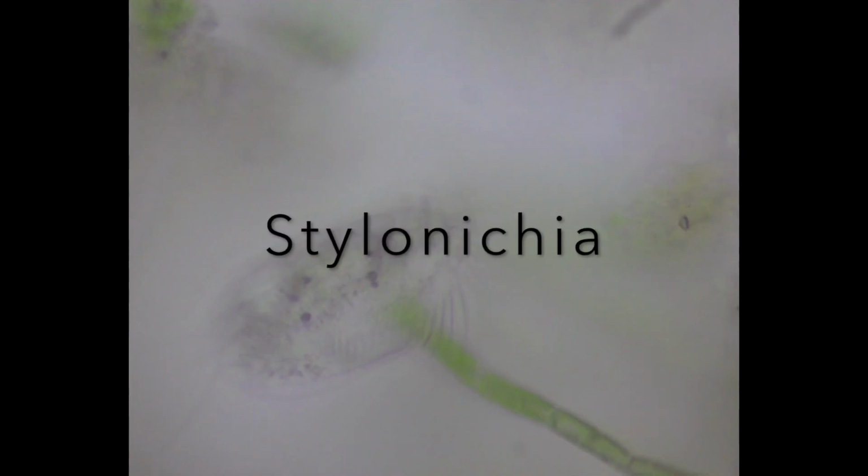The Stylonychia inhabit fresh and brackish water, where they feed on smaller ciliates. These organisms contain a row of connected cilia called cirri on the bottom of their cell body. They use these cilia to run on surfaces, however they also use the cirri to propel themselves through the water.